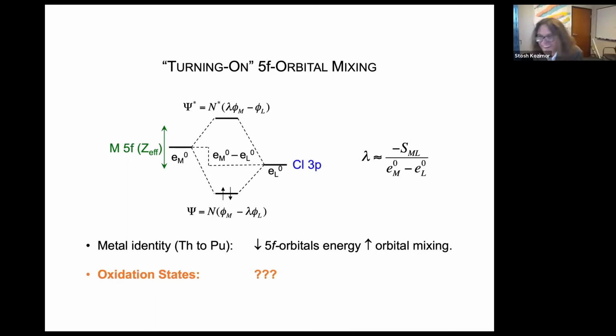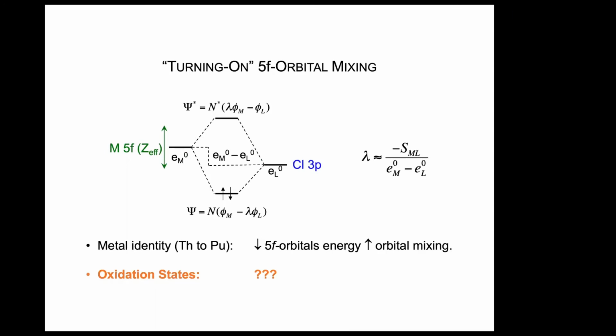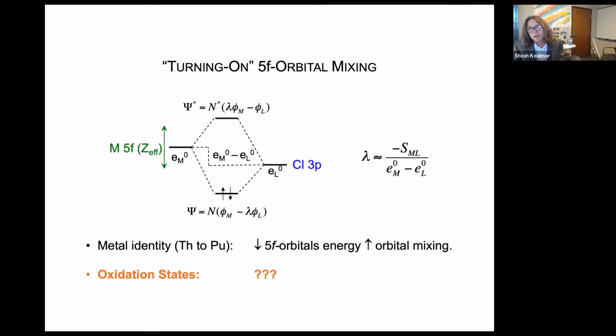Matthew, your question, please. Yes. Yeah, you mentioned that you make single crystals of these things, and that seems to present an opportunity, which is that by using polarization, you could selectively weight, say, the axial ligands or that A1 transition that you talked about. So I was wondering if you were using that and getting some more information. That's a great question.